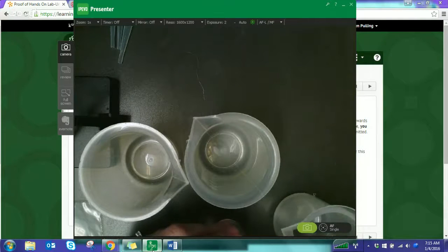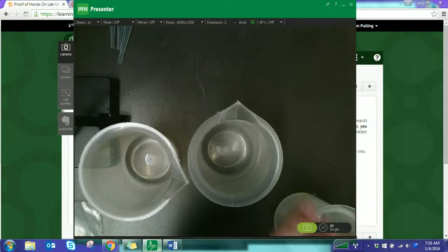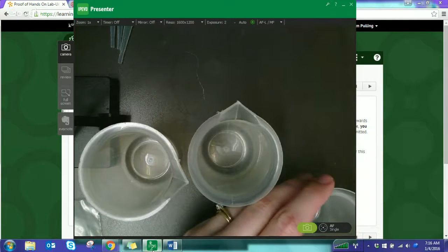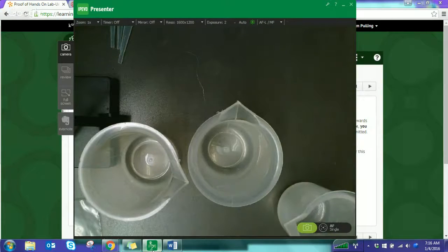So if you haven't already, get the alcohol out of the plastic bag, and then there's a little piece of foil seal that you have to pop off. You can puncture through it, or if you have nails, you can probably pick it off. And it's going to smell great. I'm actually filling it to that. How is this pouring out?